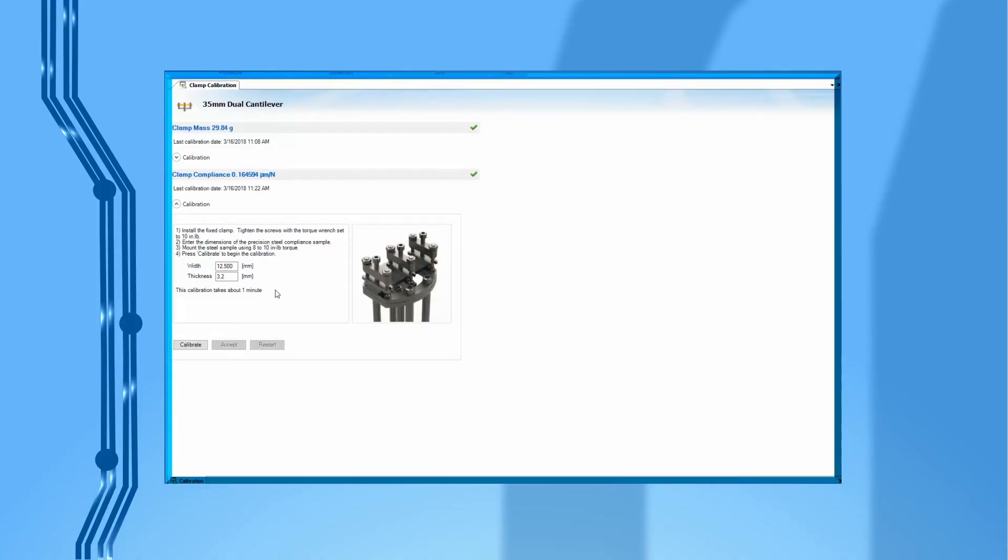From TRIO software, enter the sample width and thickness and then press calibrate to begin. This calibration step will take about one minute.